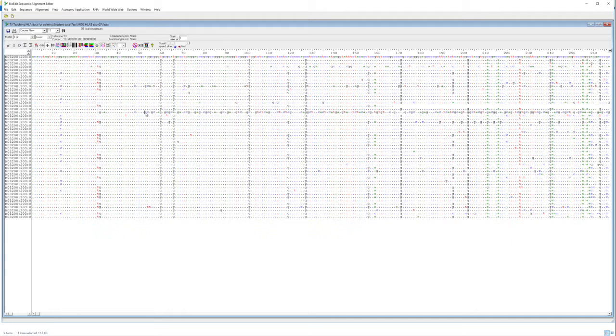So I can just delete this C, and then suddenly actually it lines up quite well. And so again, much the same as with the short sequence, if I have lots of sequences for what I need to do, this sequence we could quite possibly ignore in our analysis. But as we've fixed it up, we'll leave it as it is.